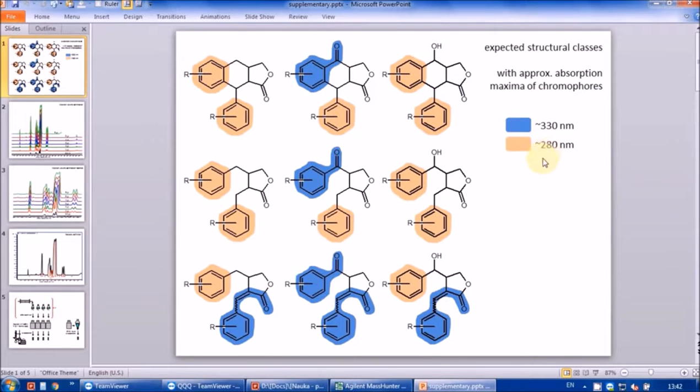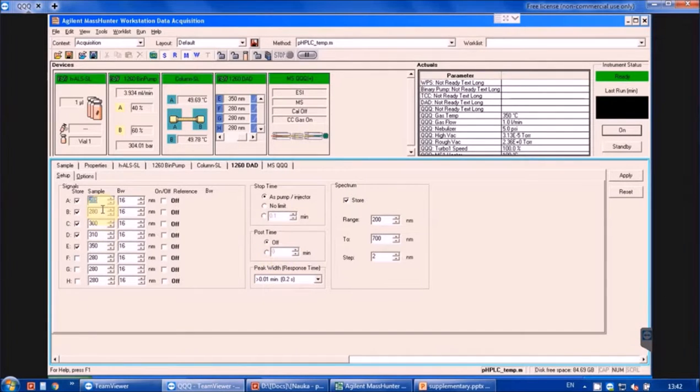However, due to high concentrations, the detector would be overloaded at these wavelengths, resulting in a flat line at high absorbance. Instead, in addition to 280 nanometers, we will use several suboptimal wavelengths such as 300, 310 and 350 nanometers. This will allow the operator to estimate the elution profile of compounds with different concentrations and collect the fractions accordingly.